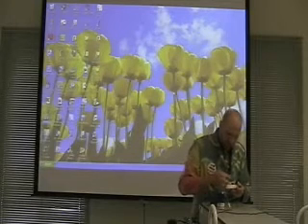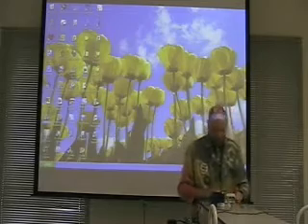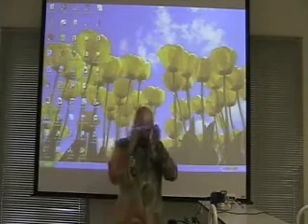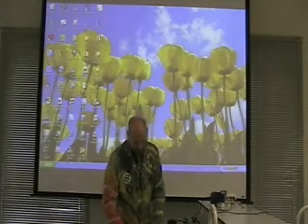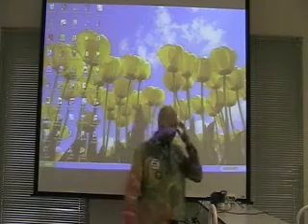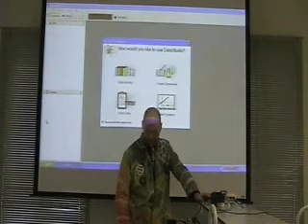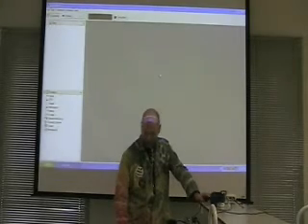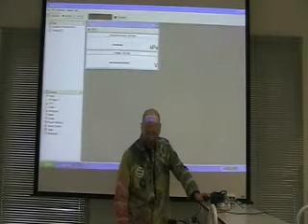So you just plug the voltage leads in here. Fire up Data Studio. And it should directly sense that we're trying to get voltage. Alright, yeah, good.